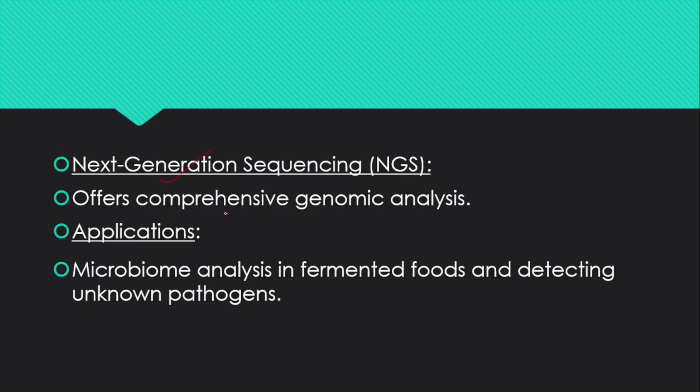Next, coming to next generation sequencing. It offers comprehensive genomic analysis and applications are microbiome analysis in fermented foods and detecting unknown pathogens.